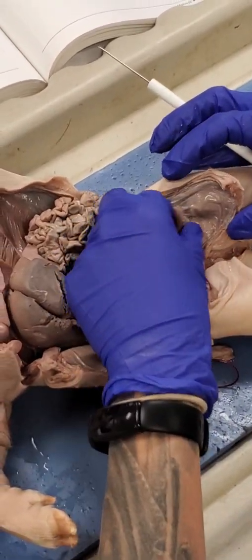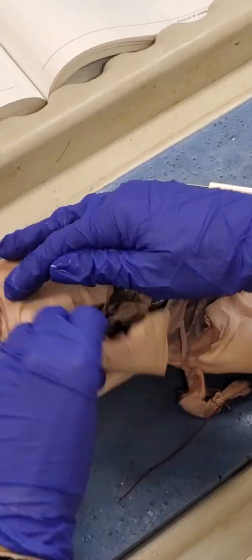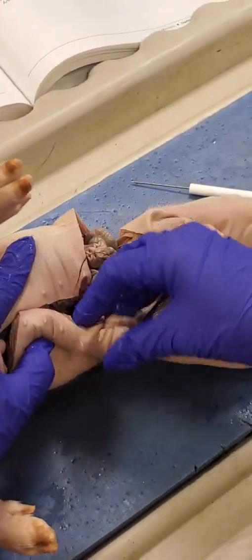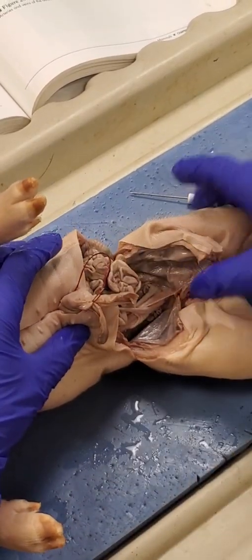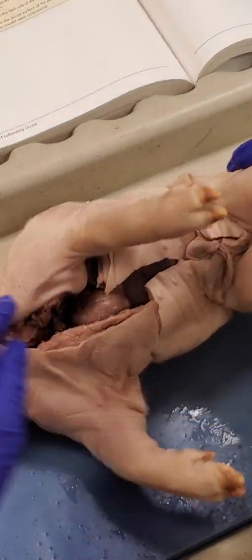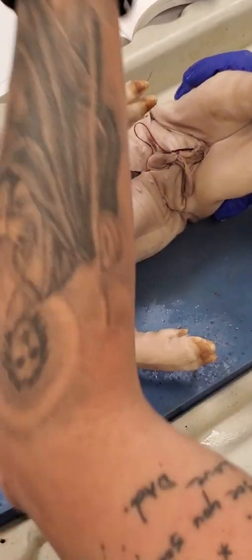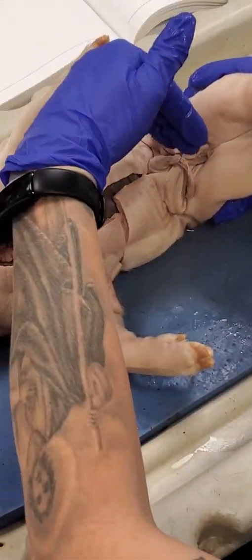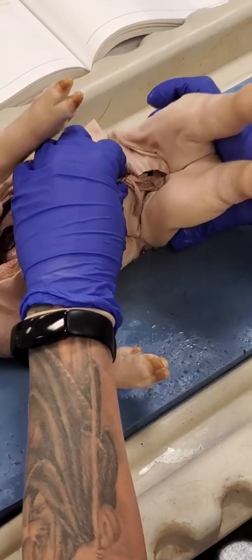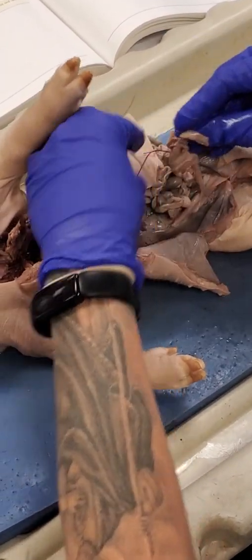Okay. And then our umbilical cord. That was something too. When this was all connected together, we did have this umbilical cord that was tied off. So it was like this. Boom. And then what I did is I made an incision down the middle. Have you ever seen people get surgery and they cut around their belly button? So I went around the umbilical cord and then I cut down, and then I cut around the umbilical cord this way, so that way it could stay connected. So I kept it connected.